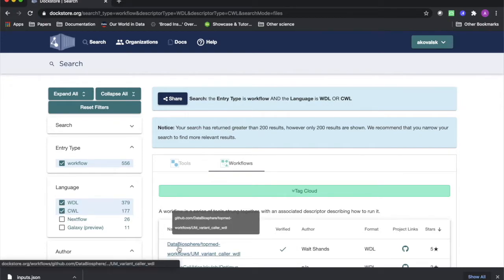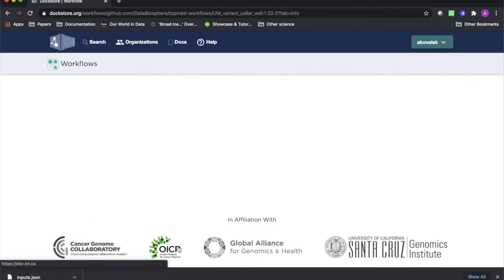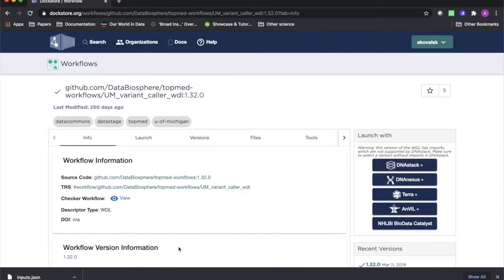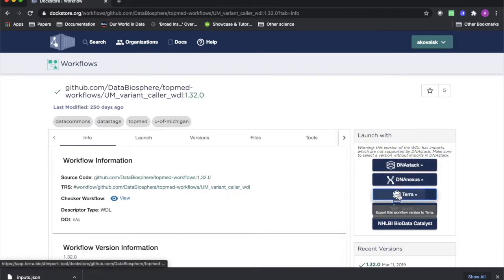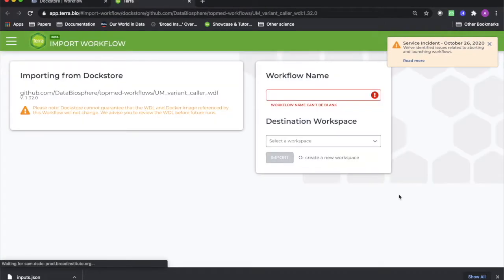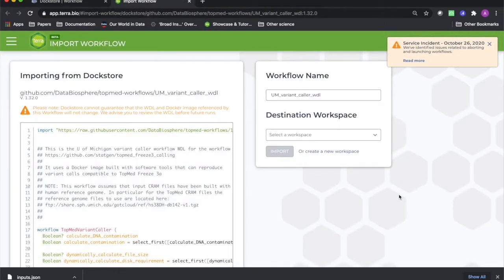Once you find a workflow you would like to import to your workspace, clicking on that workflow's name will take you to this page, where you can find a button for importing the workflow to Terra on the right-hand side.